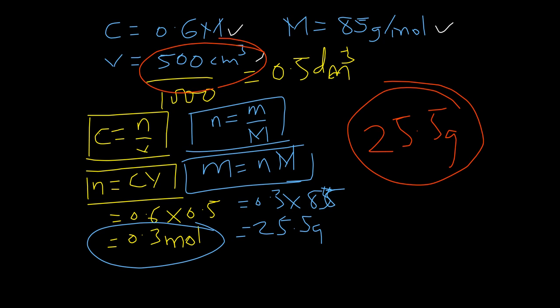So we choose that, and we pour the solution that we have prepared from the beaker through a funnel into the 500 cm³ volumetric flask. We rinse the stirring rod as well as the beaker. Then we pour all of those rinsed contents into the volumetric flask. Once we are done, we top the volumetric flask up with distilled water to the 500 cm³ mark.